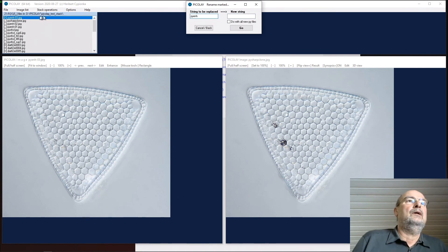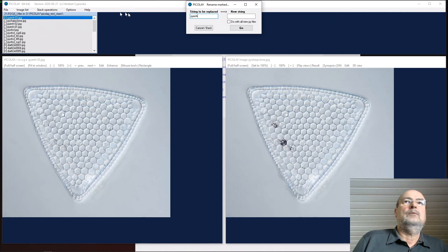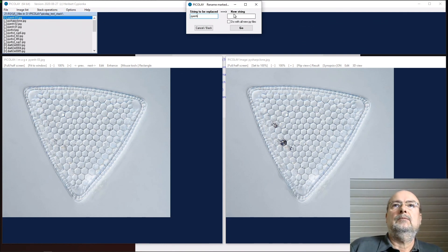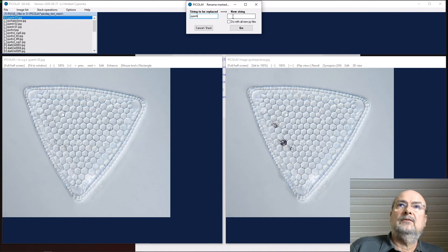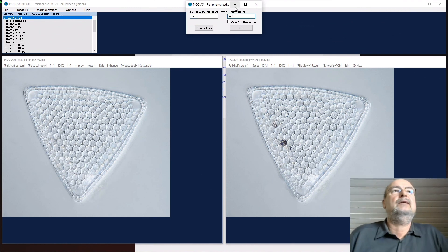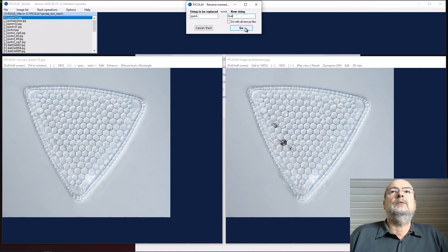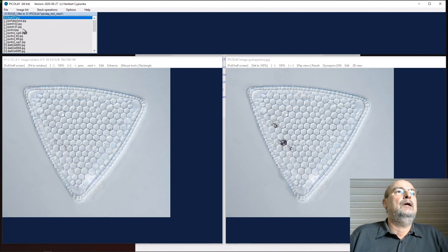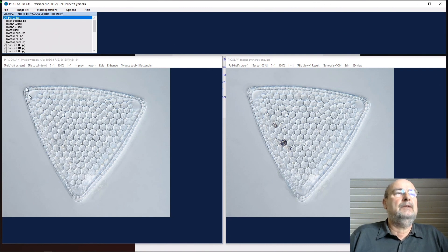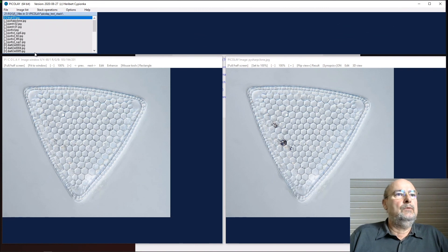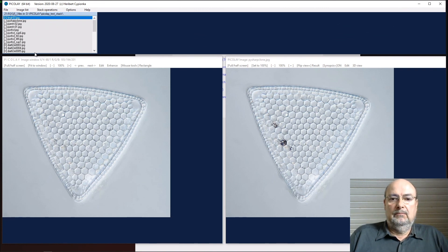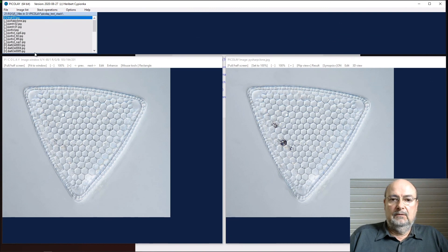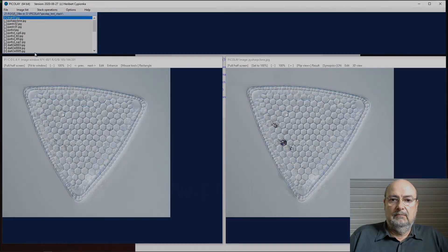And because this is only one marked, you would say this is our final result. And I would say go. We have our final result here, and I think it's a nice image of a diatom. Just download the stack and try to do this as well.